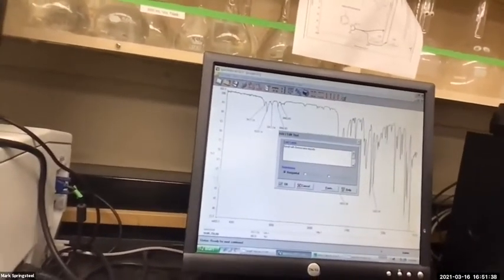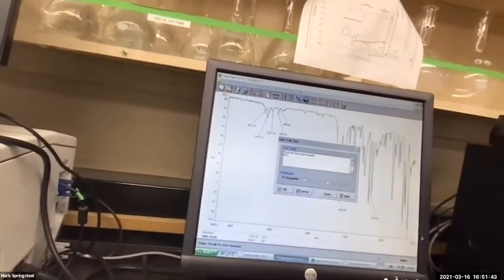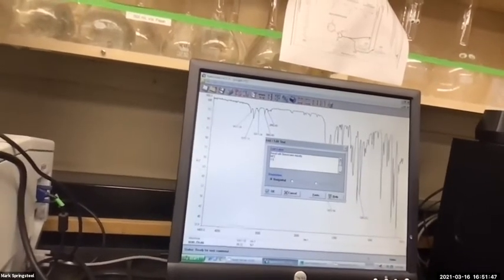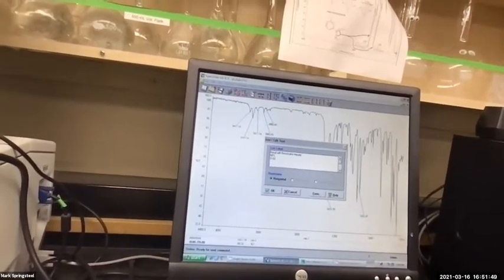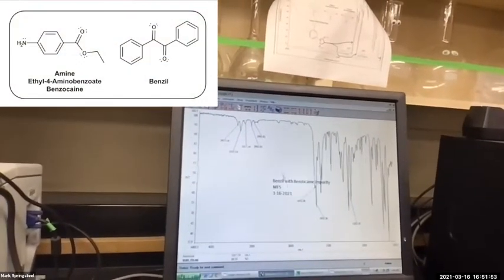And I'll put my name on there, initials at least. Yes, date, always date everything. It's good to date things because that helps you figure out when you're lost later. Okay, I'll put that here.